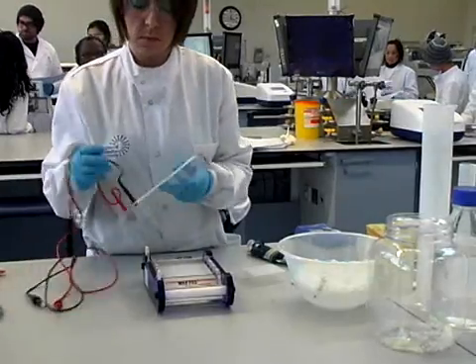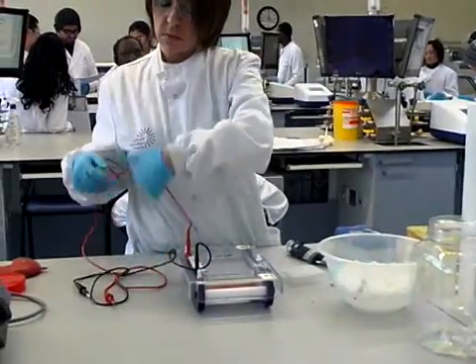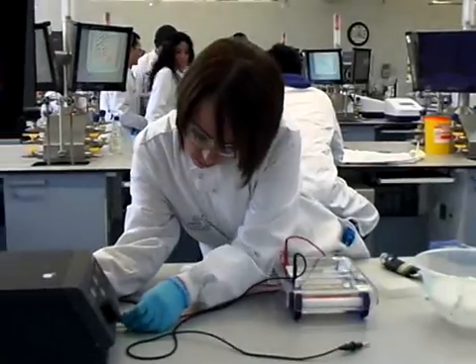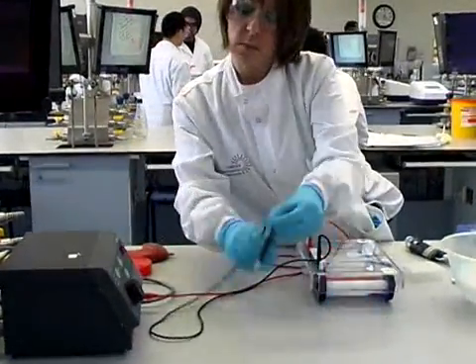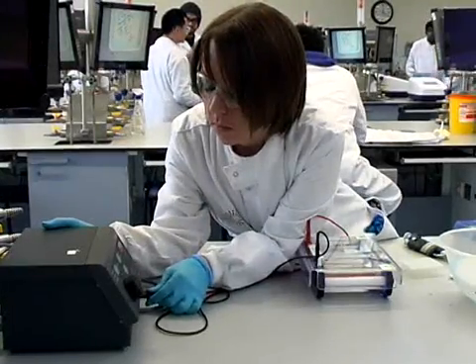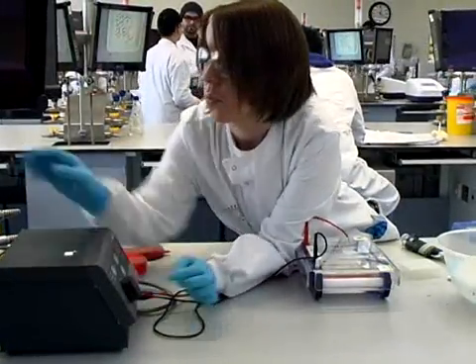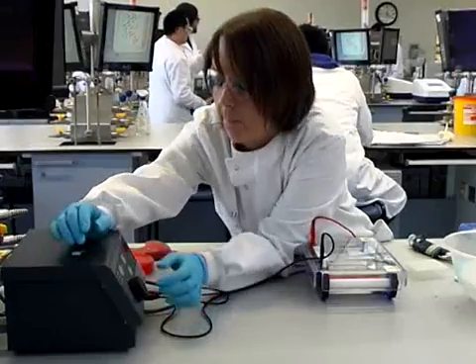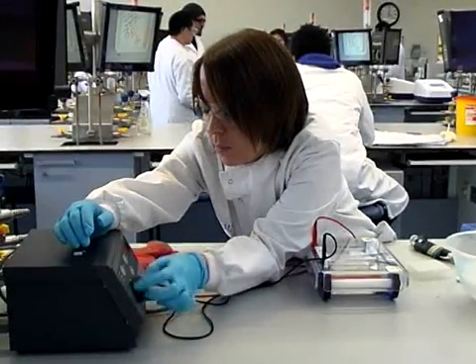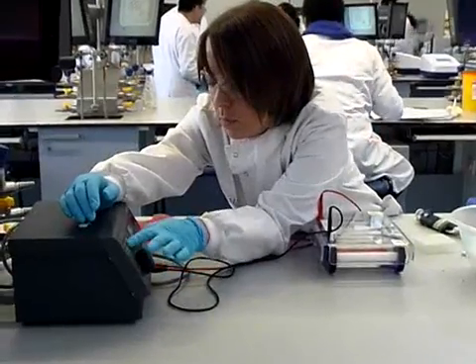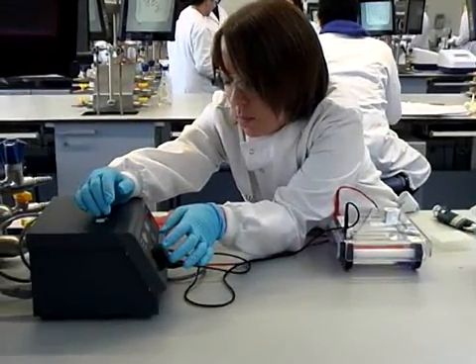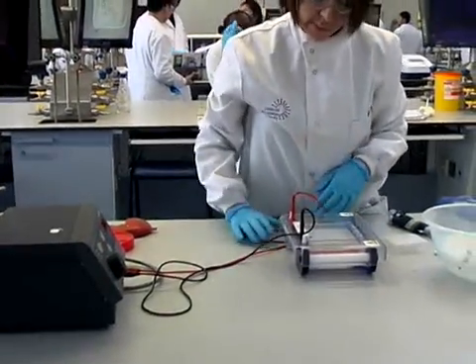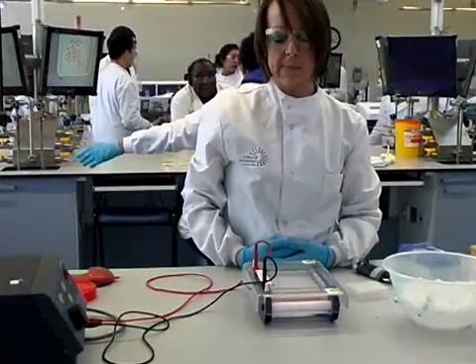Once the samples have been added, the cover is put on the electrophoresis tank and the wires are connected to the electricity supply. The current is then switched on, adjusted to the correct voltage, and now the gel is left to run for 30 minutes.